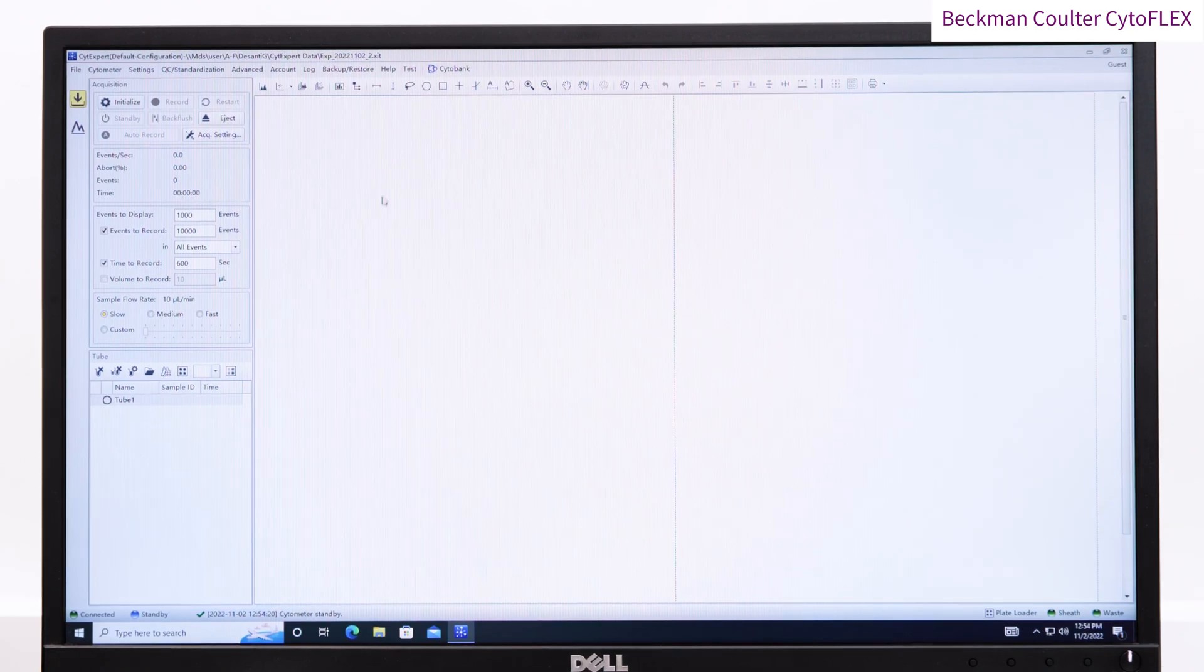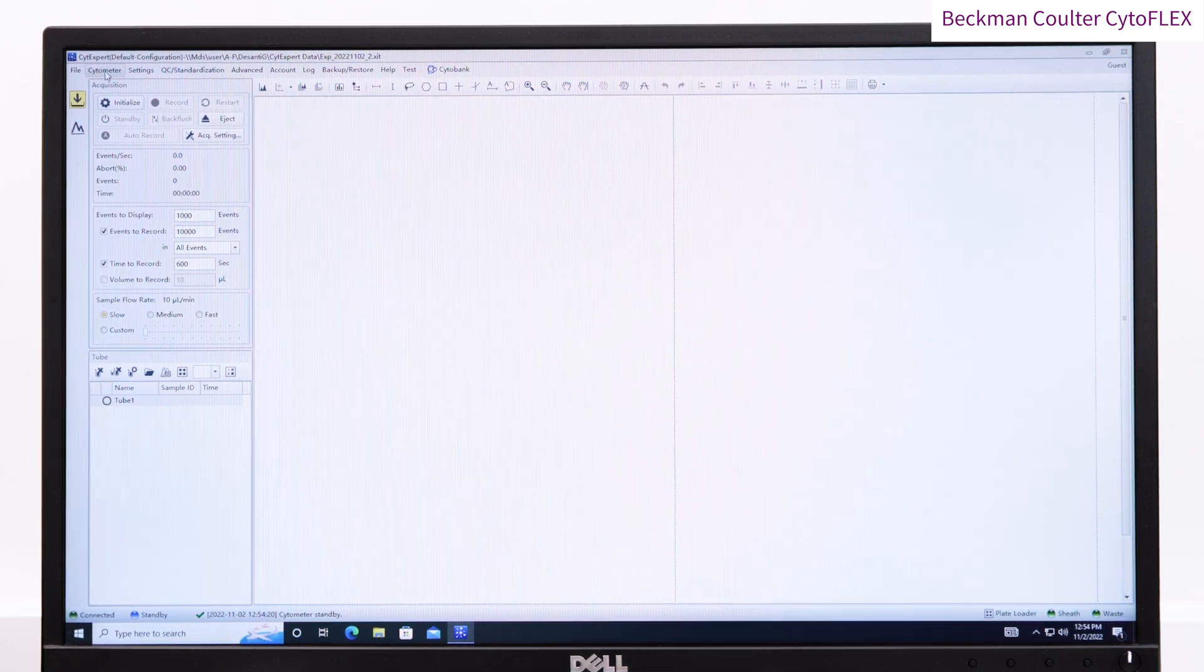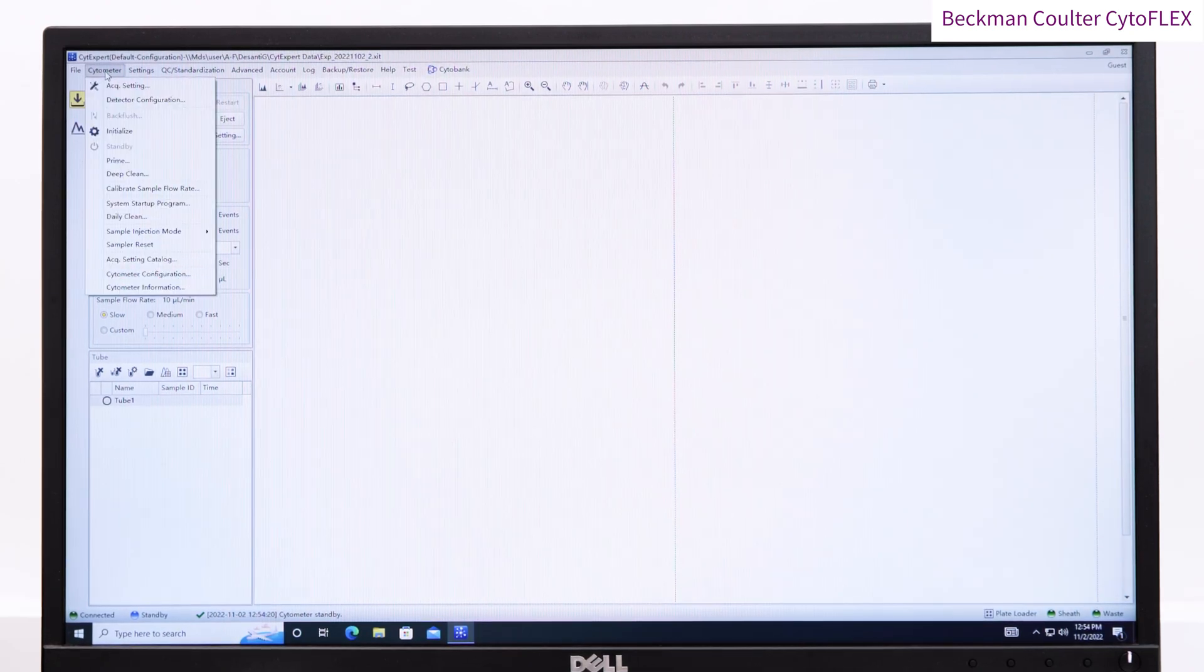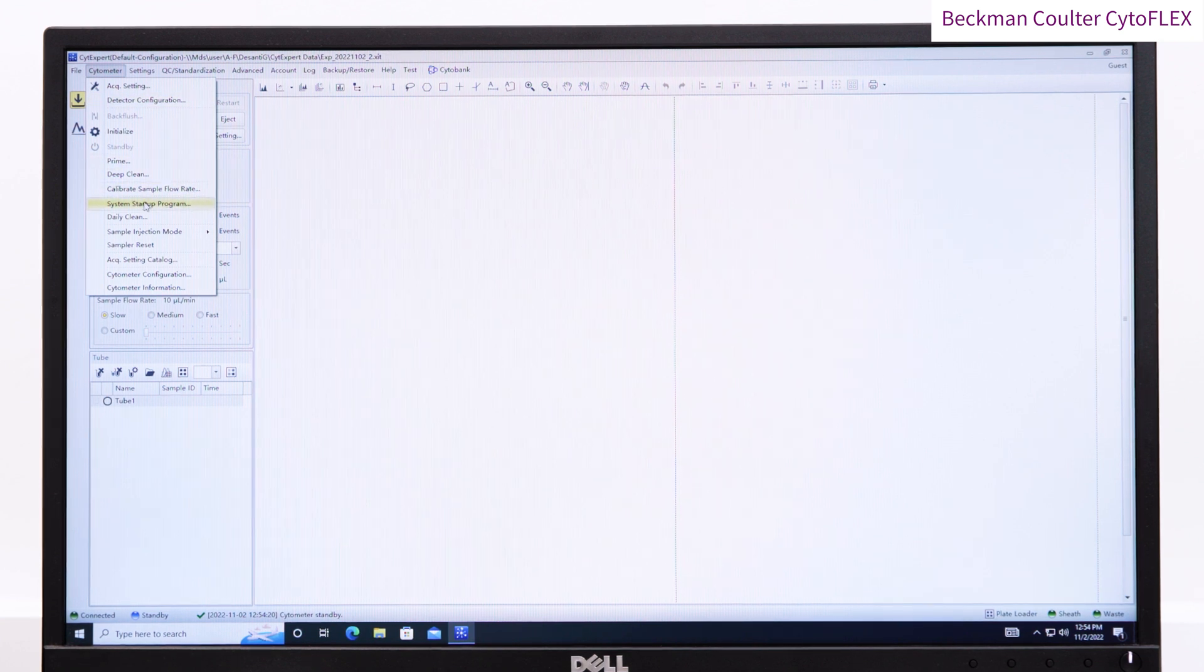Once you are ready, click cytometer, and choose system startup program, and load the plate or tube as directed by the software.